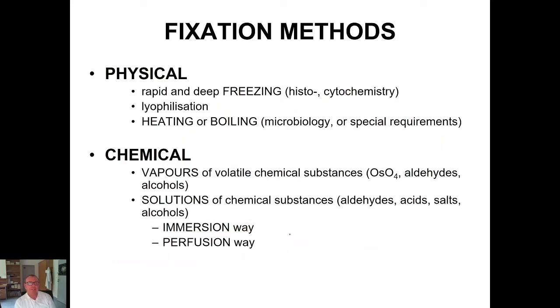What are the fixation methods? As I already said, they can be physical or chemical. Physical methods are in fact quite simple. It's mostly the use of heat, either low temperature or high temperature. More frequently it is low temperature, and that means freezing. Freezing is a fixation which you also know from home.